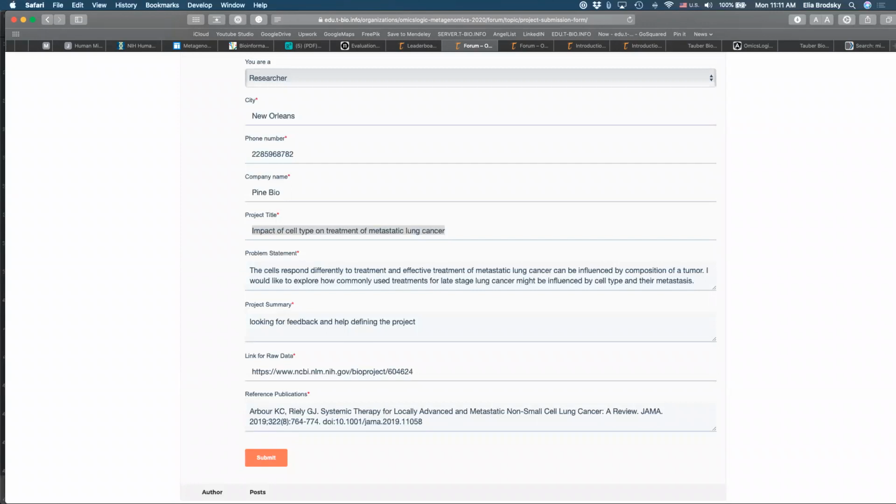Not specifically in this case, but we do have a whole section on multi-omics integration, and we will touch on association studies. Those association studies will include genome-wide association studies, association between using statistical association of feature-to-feature correlation, as well as some network analysis that could be done for that kind of a study.